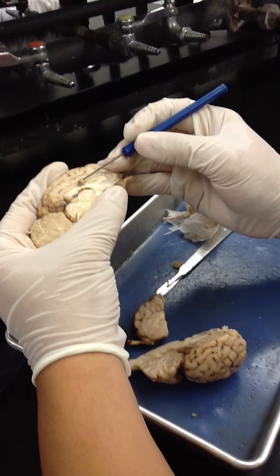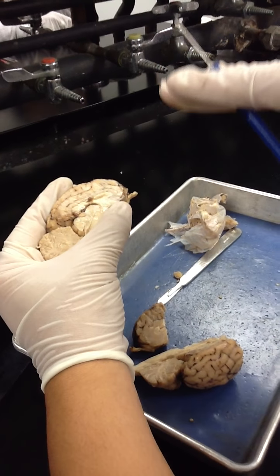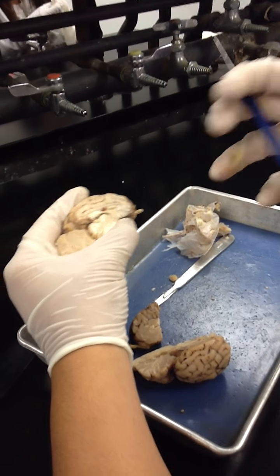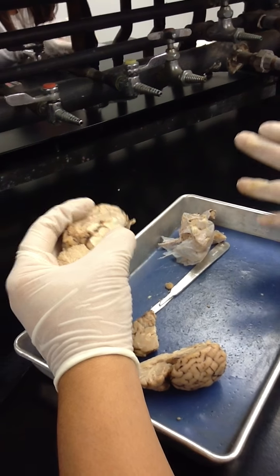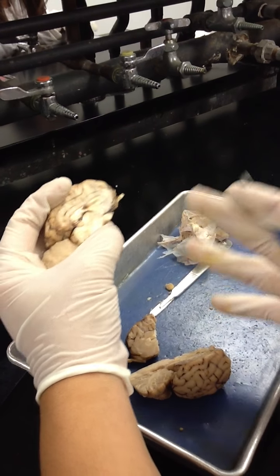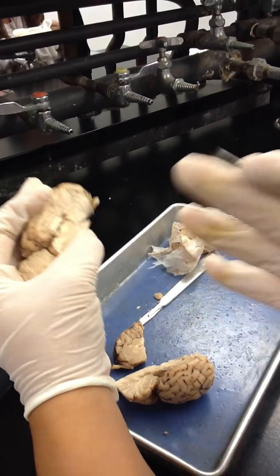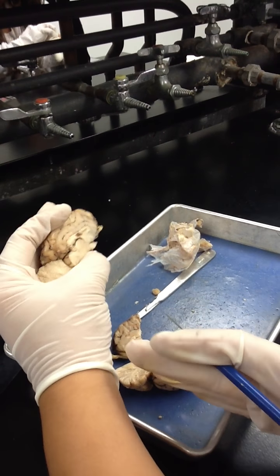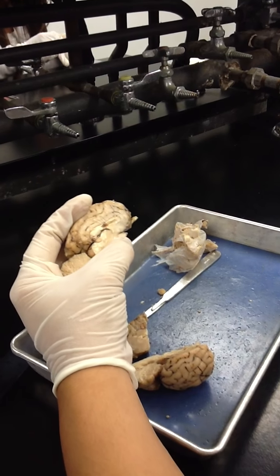The choroid plexus is blood vessels, and it is one of the areas where we draw out blood fluid and create cerebrospinal fluid. Basically, cerebrospinal fluid is like a filtration of your blood plasma. It doesn't have quite the same content of ions and especially proteins. It has no proteins pretty much. So composition-wise it's a little different, but that's where it comes from.